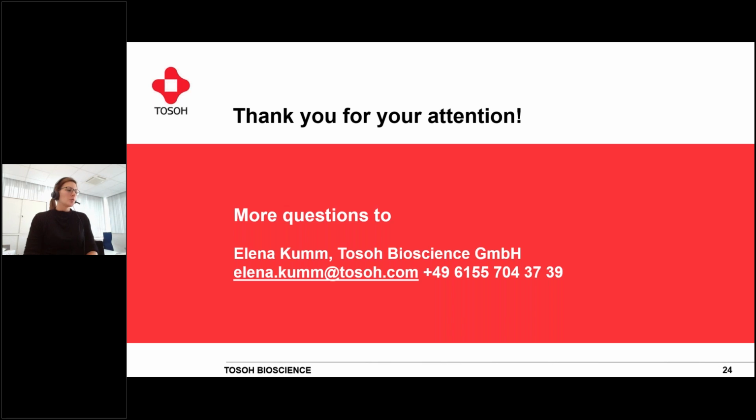Yeah, I mean, it depends how small your peptide is. If it's not too small and you have bigger samples that are having a different size, of course, you still could go for SEC, or if it's maybe hydrophilic, you can also use HILIC. It depends always on what peptide you have and how it looks. If it's really, really small, of course, you will even lose the hydrophilic part, and then it's tricky. Then you could, of course, go for reverse phase. This is what most people do for peptides, right?